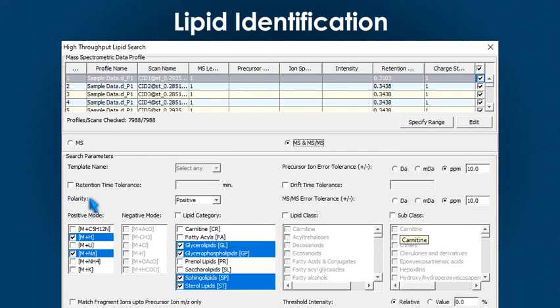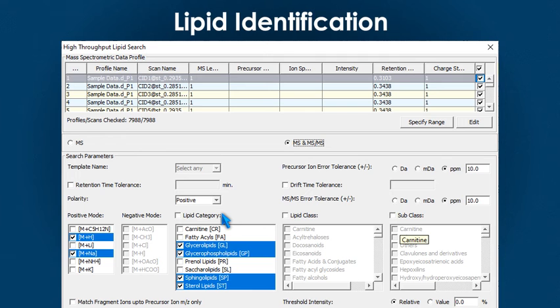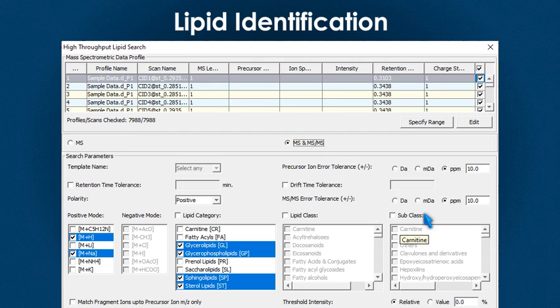Depending on the polarity, positive or negative adducts are available for selection. Similarly, one or more lipid categories, classes, or subclasses can be selected for the search.